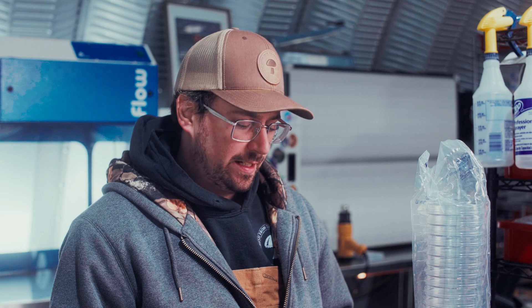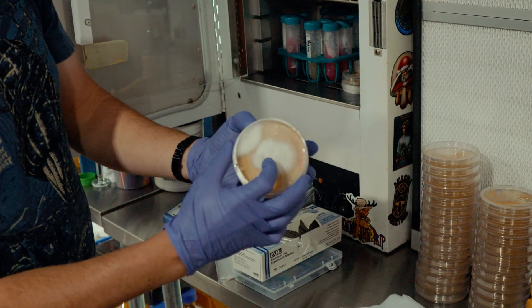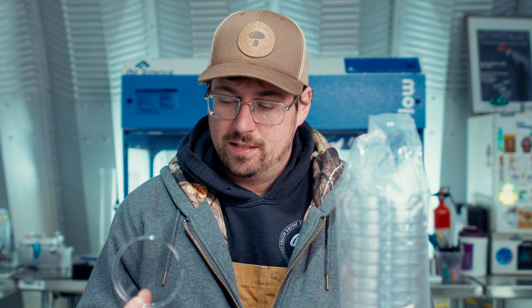Another pro of the plastic dishes is that they're very versatile. You can get a bunch of different sizes and features depending on your application. For example, when I do my breeding projects, I'll usually get the 40 millimeter dishes because you can fit a lot more plates in the incubator — and I don't think there are options for that with glass petri dishes. They also make plastic dishes with dividers, so you can do different experiments on the same dish, which allows you to do a lot more with special applications.